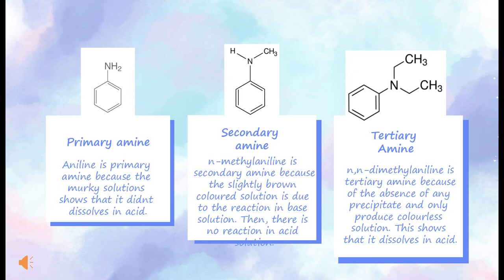Before moving on to the next compound, I just want to make it clear that this Hinsberg test is to test and to distinguish between primary amines, secondary amines, and also tertiary amines by their reactions with benzene sulfonyl chloride in acid solution and in base solution.